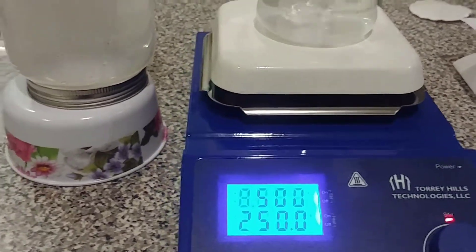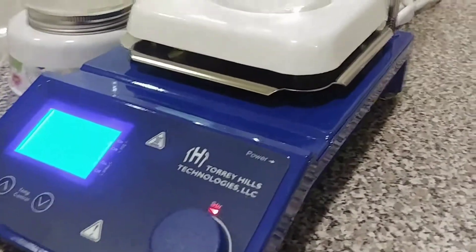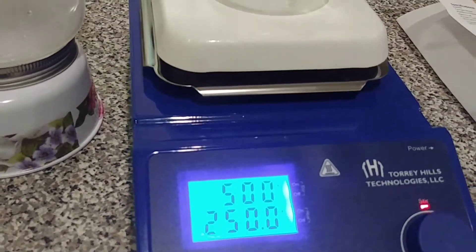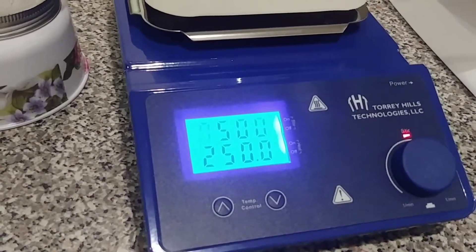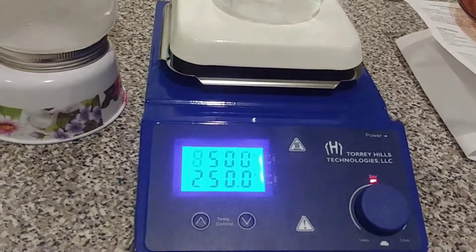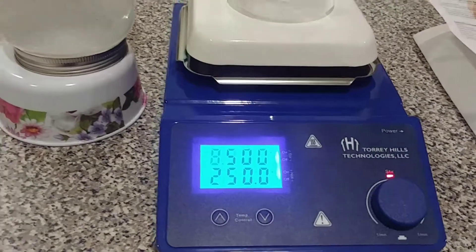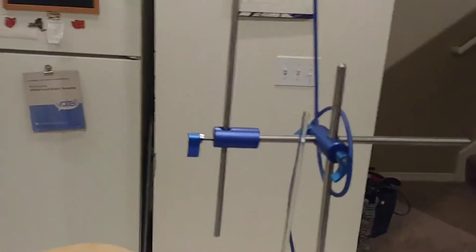I'm pretty happy with it — it's a fairly decent quality one. Out of all the chemistry equipment I've been getting lately, I wanted a good quality hot plate. This is definitely the largest investment I've made so far. Time will tell how well it holds up, but I'm pretty sure it'll be good — it comes with a two-year warranty.